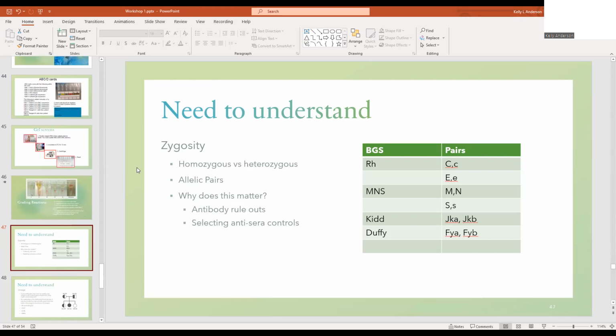We're gonna set up a reaction in general and see what that looks like. Before you spin anything, you wanna just mix it up, make sure that everything is mixed. Okay, good, and then make sure everything is figured out.